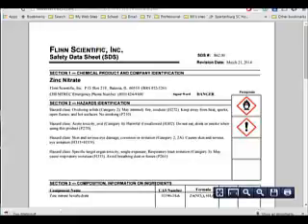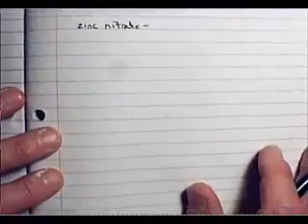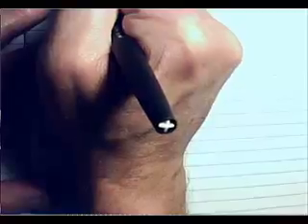Last thing you have to do for the lab is have a summary of your procedures. In your lab logbook, make sure you summarize your procedures. It's not a real complex set of procedures. I hope you worked on this some before, the day before the lab. But if you didn't, you've got a lot of work to do tonight. You want to summarize procedures so when you come in here, you know what you're doing.